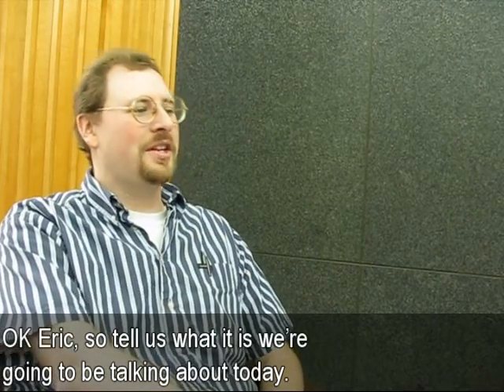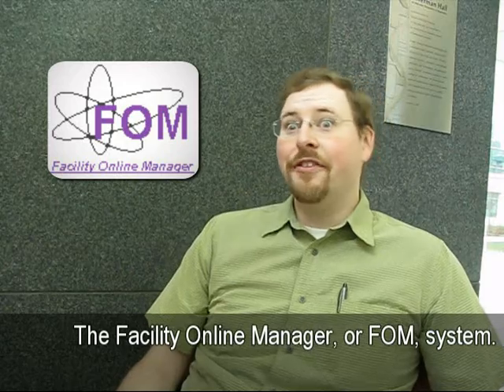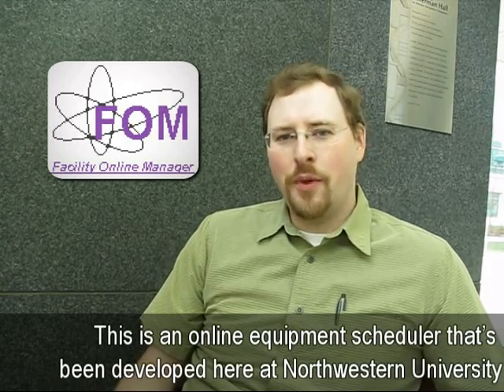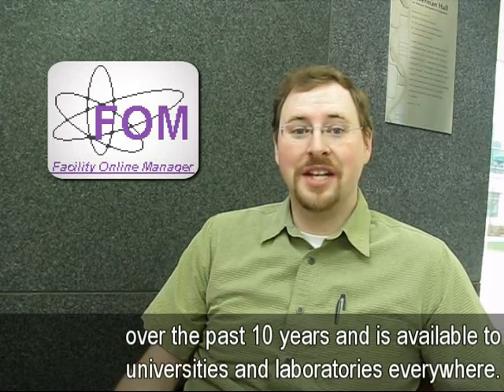Okay Eric, so tell us what it is we're going to be talking about today. The Facility Online Manager, or FOM system. This is an online equipment scheduler that's been developed here at Northwestern University over the past 10 years and is available to universities and laboratories everywhere.